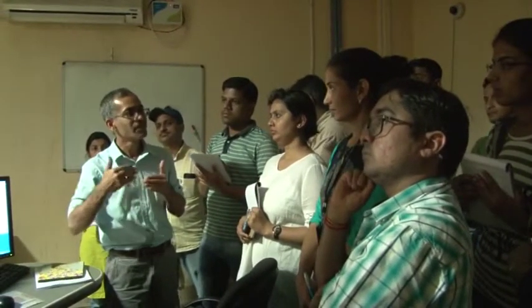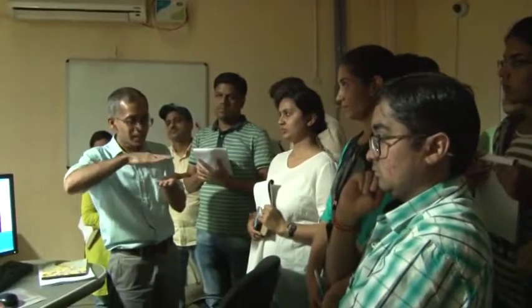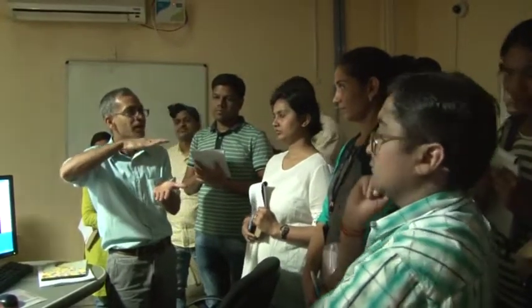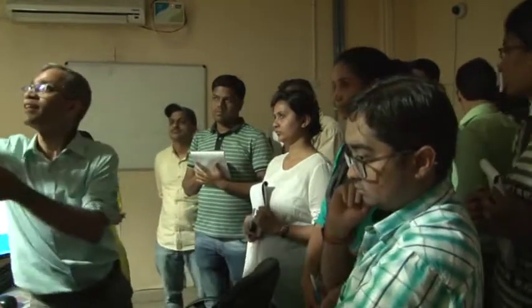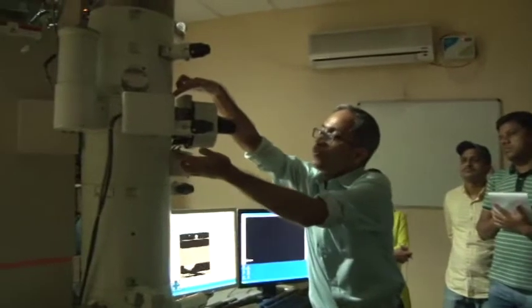It is the objective lens, and this objective lens is very important because it forms the first image and the first diffraction pattern, and the quality of the microscope is very heavily dependent upon the quality of the objective lens. Also, that is an area which has most of the very important components, in this portion here, from here up to here.